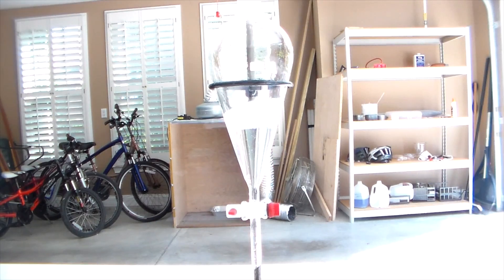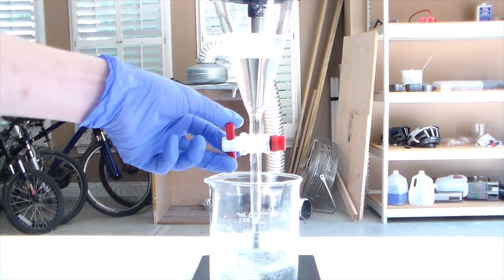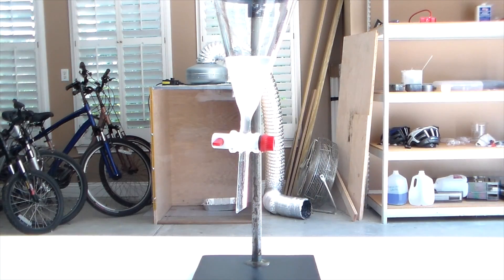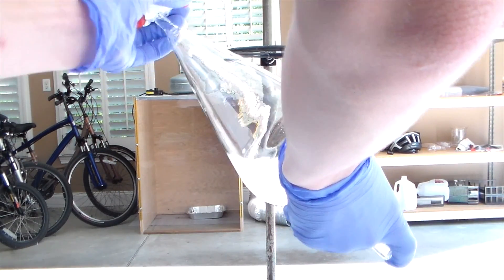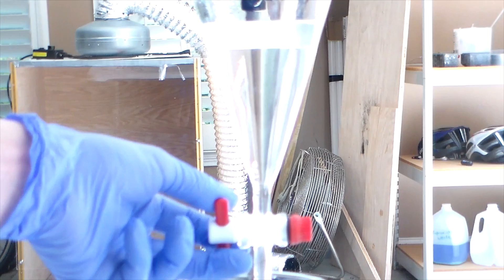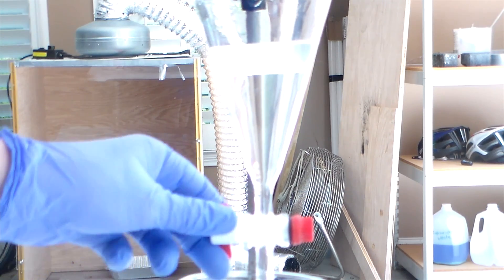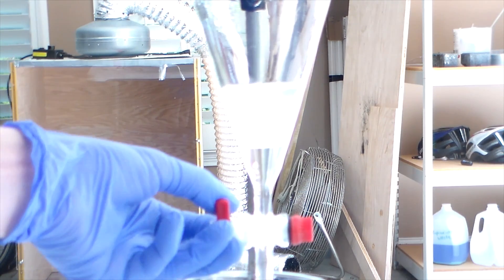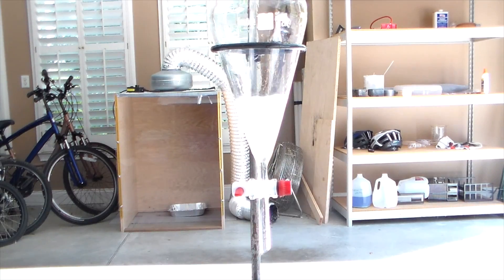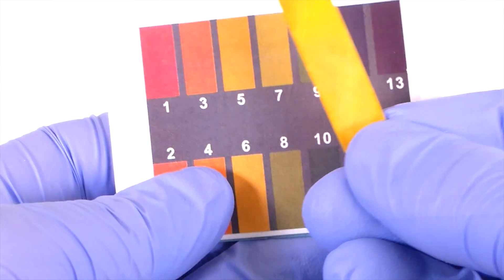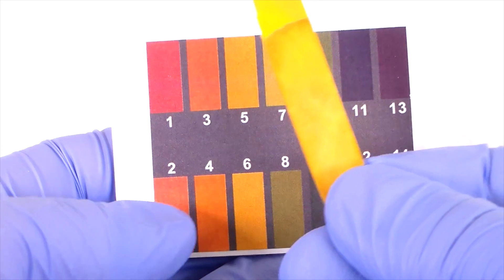After shaking, allow these layers to separate and then discard the lower aqueous layer. Now repeat that washing process, but this time using distilled water. Once again, drain off the lower layer and retain the upper layer which contains our product. Repeat these water washes until the product reaches a neutral pH as judged by litmus paper.